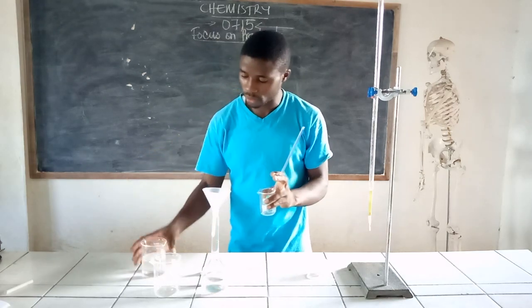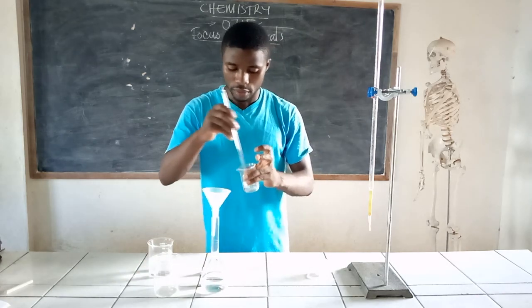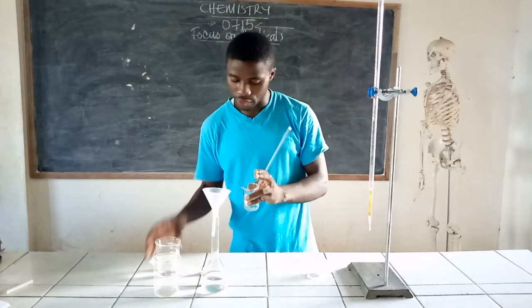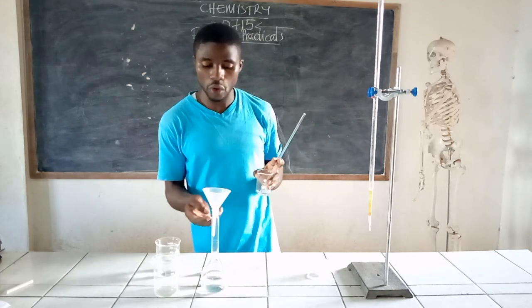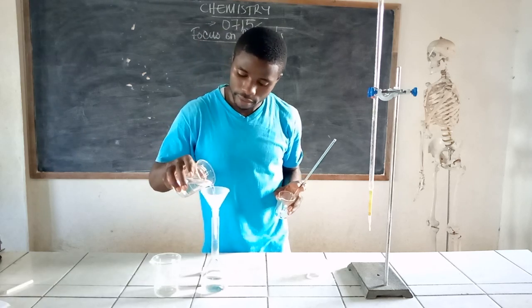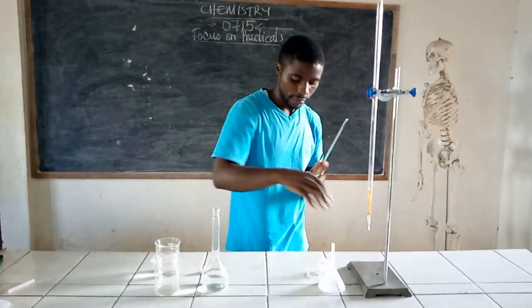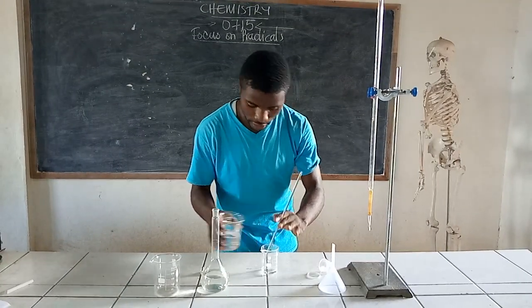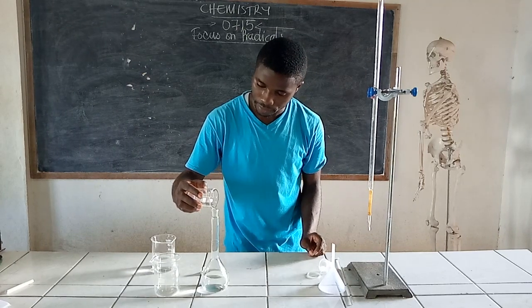When that has been done, carefully remove your funnel and stirrer, rinsing them as well to make sure everything is accounted for. Keep those aside. Then I proceed to adjust the solution up to the mark. I am still using the beaker I used in preparing the solution, so that any remaining drops can be rinsed into the volumetric flask.